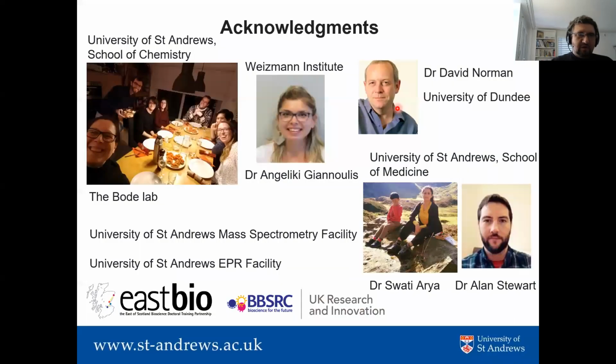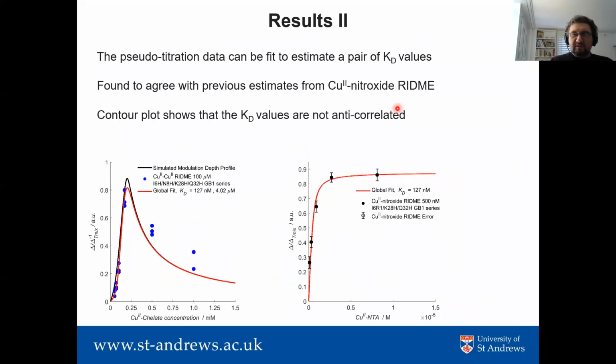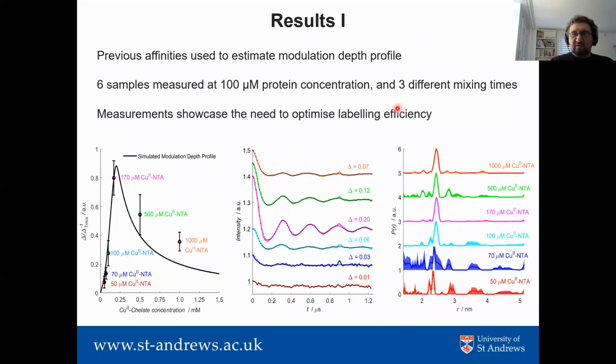Very nice presentation and also nice and useful work. Congratulations. I wanted to ask, it was not clear to me when I saw this kind of presentation before, that at ambient temperature, when you're performing the labeling, the KD is not as good as it is at low temperature.